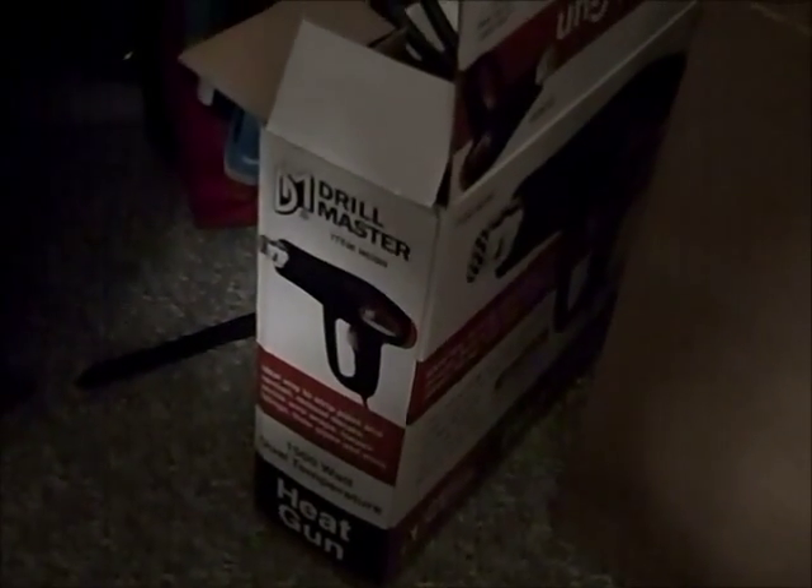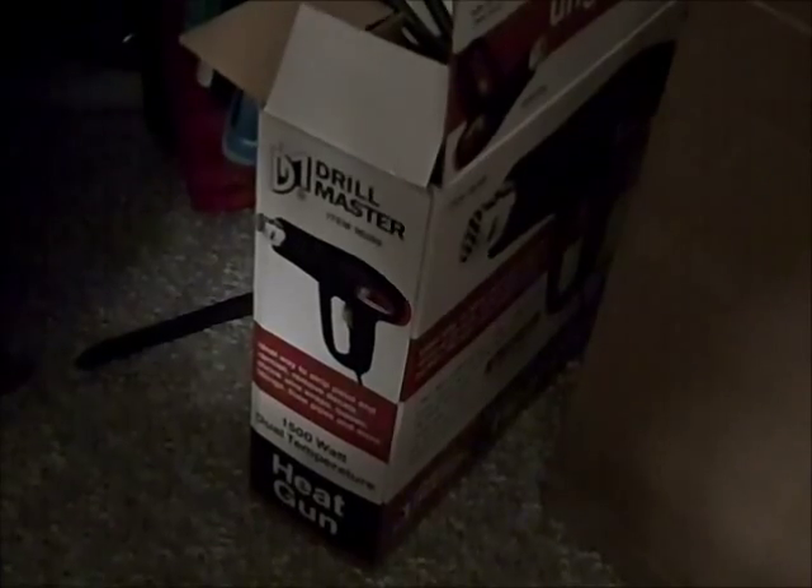While we're on the topic of heating, something interesting that I have in my possession is this heat gun. It gets to around 550 Celsius on the highest setting, so it gives more heating than the hot plate, but not so much as a propane torch, which I'm looking to obtain soon.